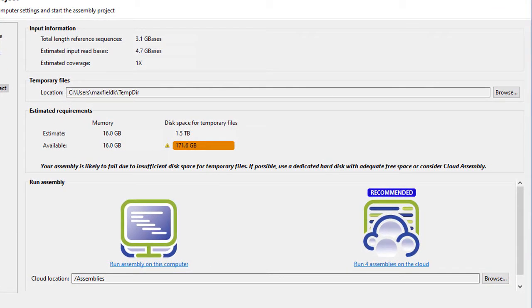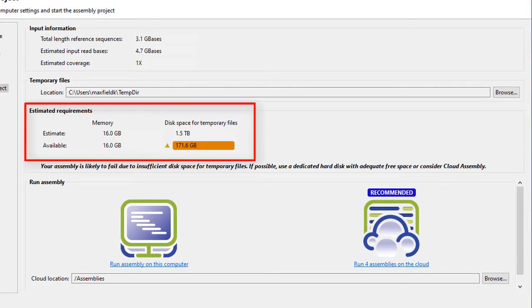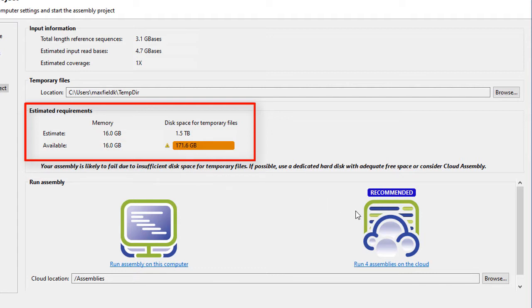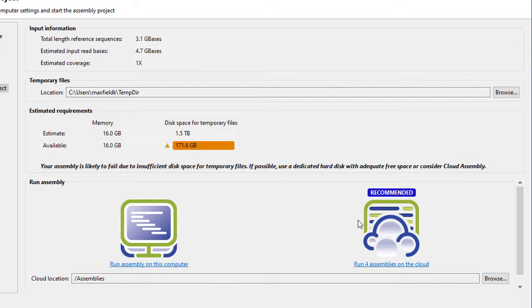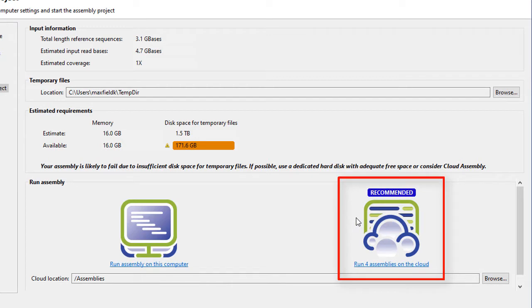Here, Seekman Engine estimates the memory and disk space required to complete your assemblies successfully. In this case, the disk space required exceeds what's available on my local computer, so Seekman Engine is recommending that I run these assemblies on the cloud.